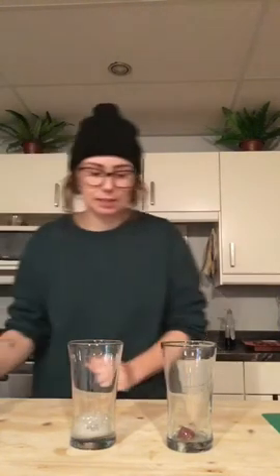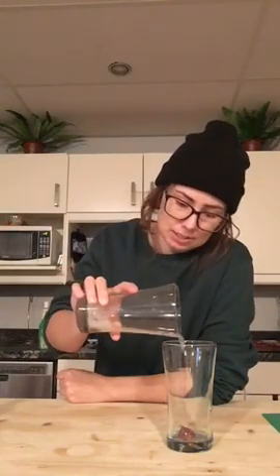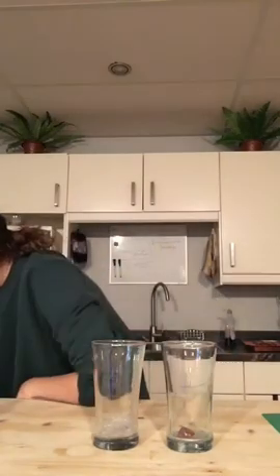And then, yeah, that got hot. I'm going to put this solution into the fresh liver. Yeah, that barely reacted at all. So that's a 0.